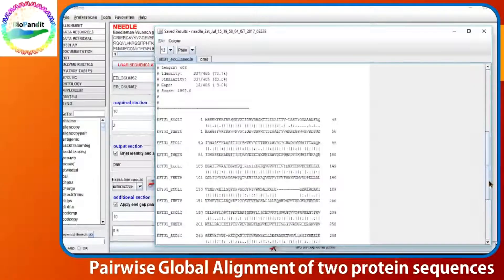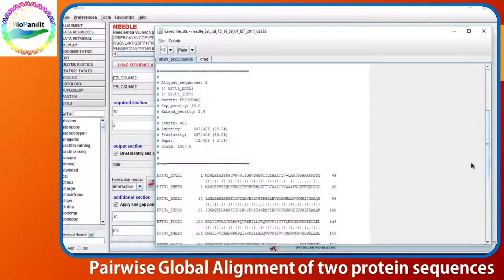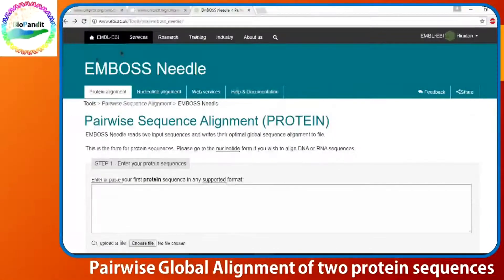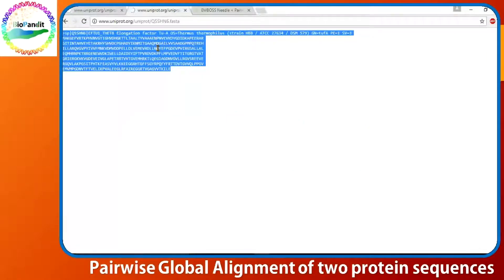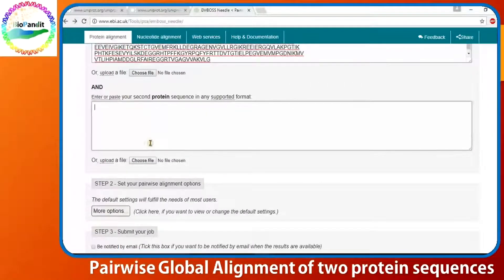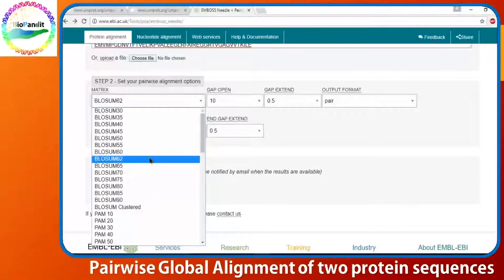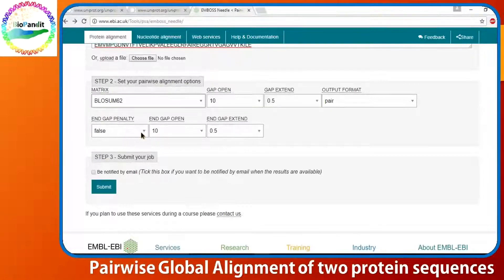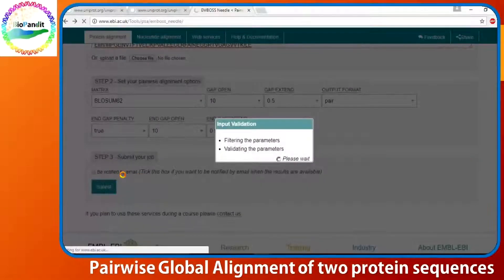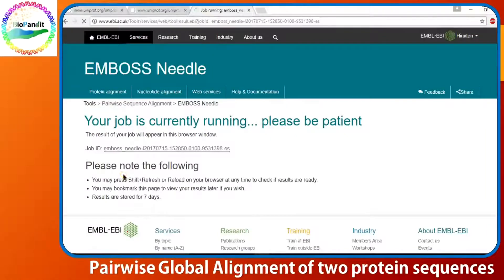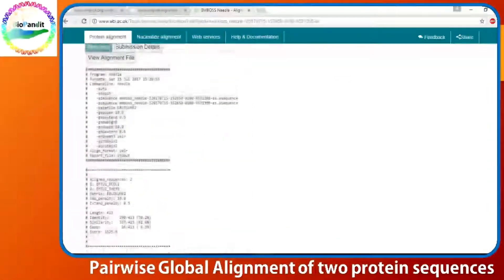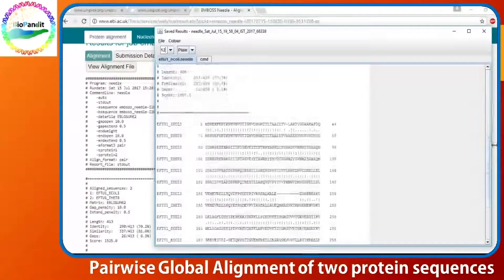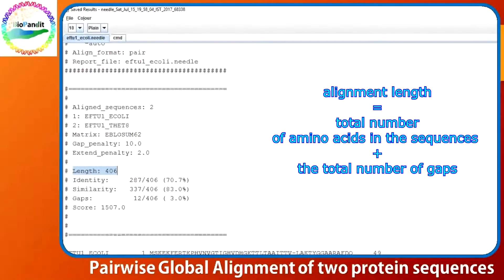There are gaps, obviously. Those represent evolutionary insertions and deletions. The method to use the web server is pretty much the same — you provide two sequences in the two boxes, hit the more options button, set up your substitution matrix and gap opening and gap extension penalties, and hit the submit button. You can see that the program provides you the alignment length, which is the total number of amino acids in the sequences plus the total number of gaps introduced to align.